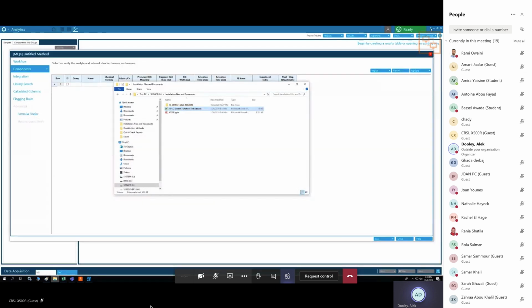So what I will do is, I have it in an Excel sheet. Just give me a second because I already have it in a nice sheet. Where am I looking?